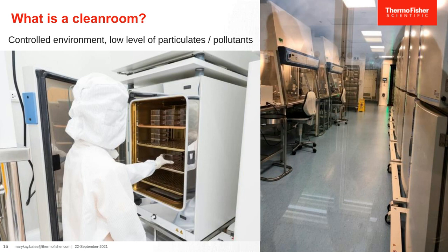So a clean room is a controlled environment. It is an isolated room with low levels of particulates. And in fact, a clean room is defined as a room where the particle generation, retention, and introduction are all controlled. Okay, so that's important.